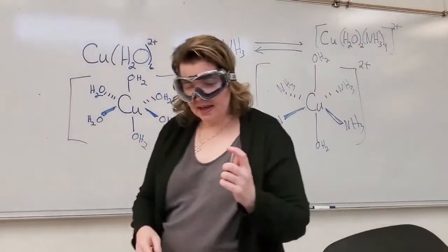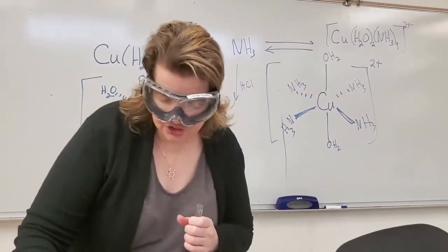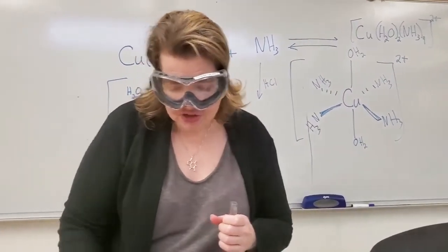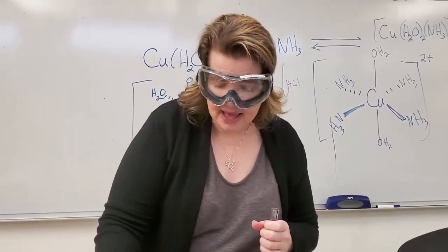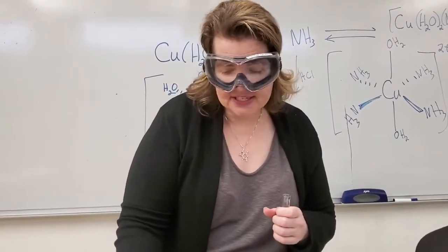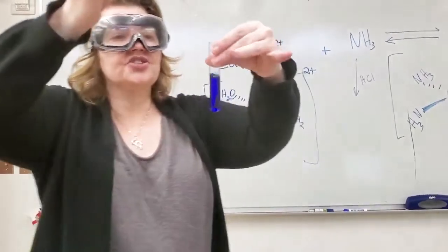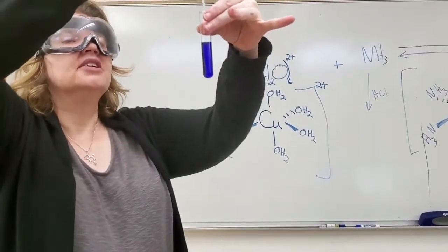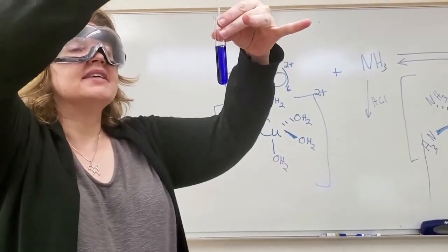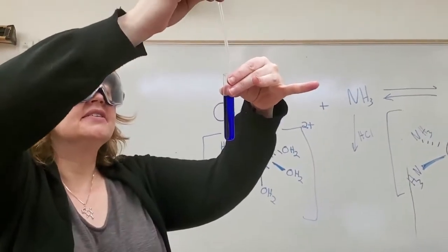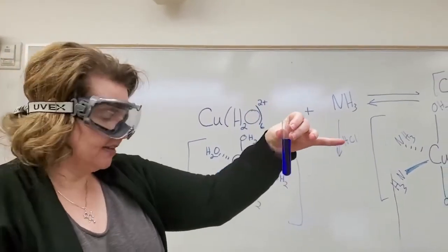The lab is written as if these concentrations are the same, and if they truly were the same, we would expect that the amount of ammonia I added, I would have to equal that with the amount of acid added back. But my concentrations are off, so I'm just going to push it back the other way. As I add my HCl, oh, I might have to add a lot more.